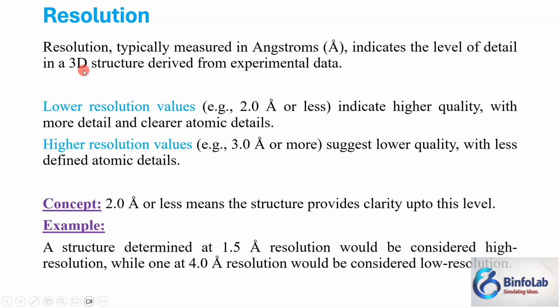So the first one, you will see a method, but I explained the method part. Now the second thing, you will observe resolution. What actually is resolution? Resolution is typically measured in angstrom. For example, if you are seeing 1, that means 1 angstrom, 2 angstrom, 3 angstrom, and so on.